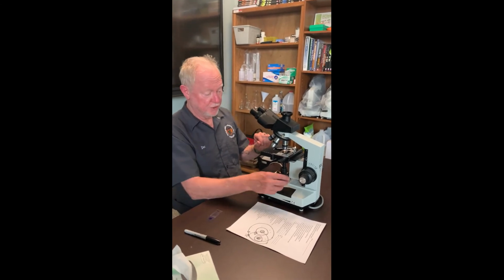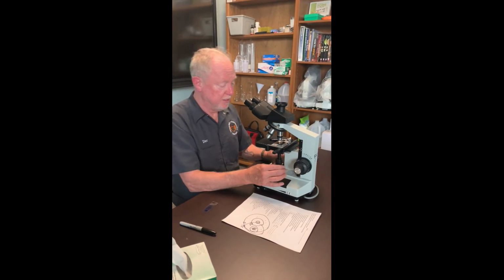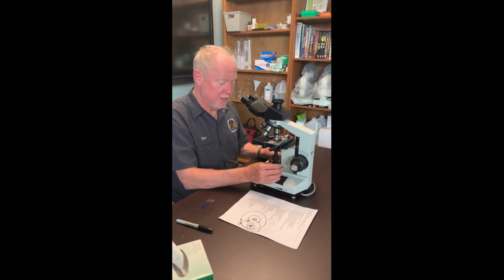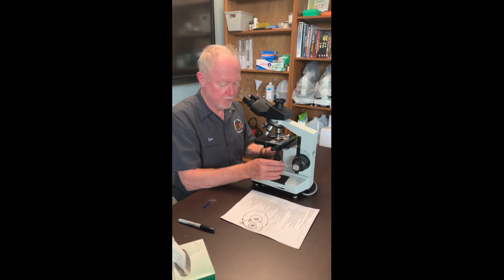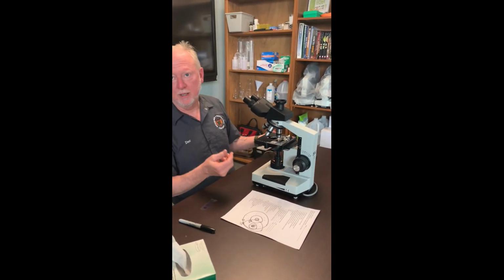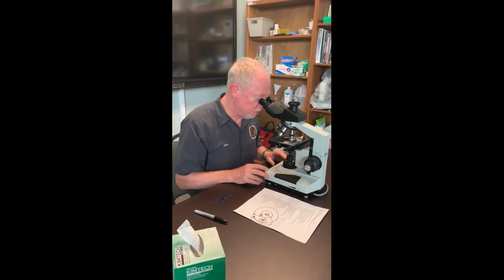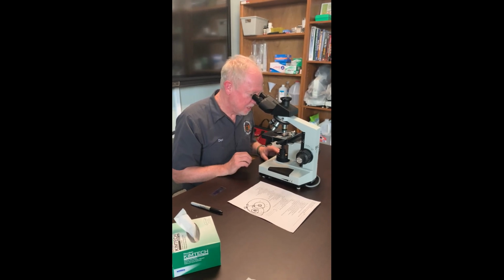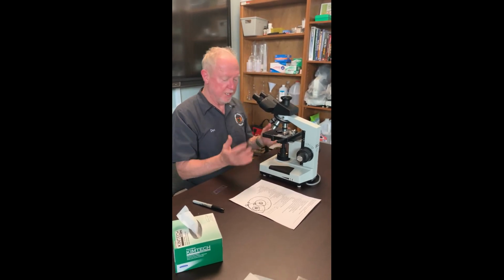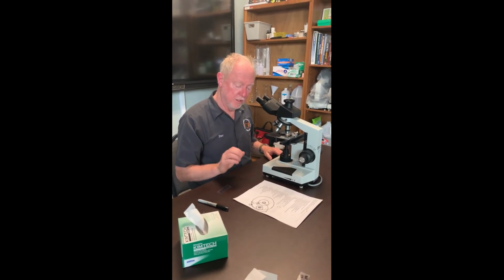If you wiggle this and it doesn't move, then your object is not what's in focus. A lot of different reasons, of course, like plugged in and turned on. We've already gone through that. But there could be a handful of reasons why you can't see anything or can't see nothing, and knowing how to troubleshoot that will save you lots of headache. All right, end of video 4.